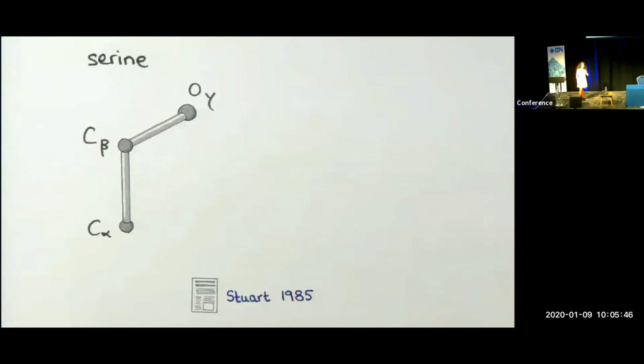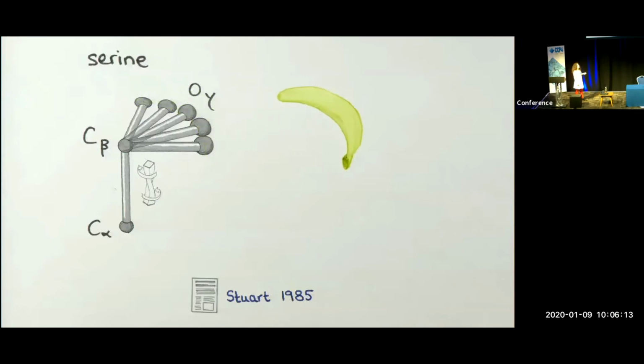And in a protein, if that terminal oxygen were to be more flexible than the 2 carbons, then this will generally be propagated in the protein by a twist around the carbon-carbon bond, so that torsion angle can occupy several values and produce a range of possible oxygen atom positions. And if we have a look at the distribution of those positions, then it is very much like a banana and not very much like a lemon, which is accessible through B factors.